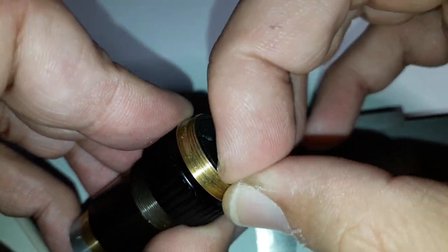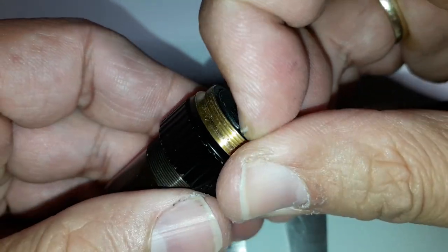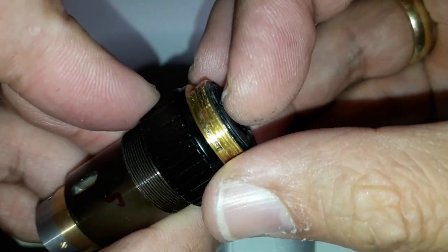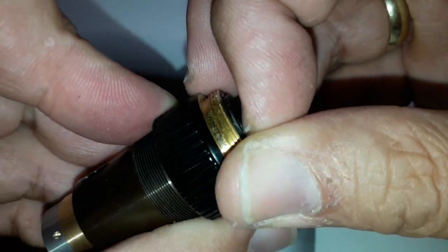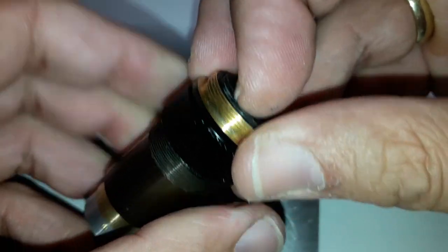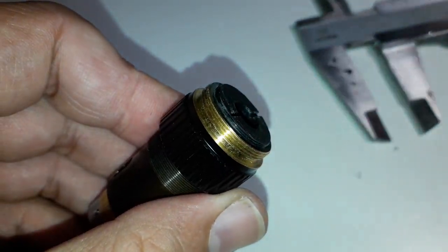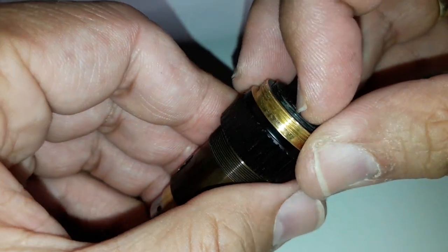One of the things that surprised me is that ultimately it is quite easy to take the objective apart. Of course, there are no parts that are glued here. But the front lenses themselves are sometimes actually held in place with a so-called lens cement. All of the other parts here are actually accessible.